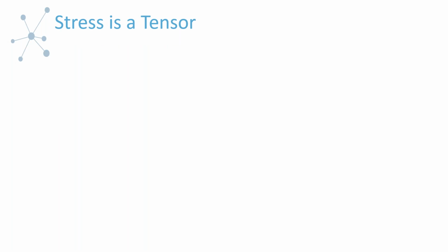So as we know, one of the components that we need to deal with is the dynamics, or the stress distribution that is generated under a particular deformation. And stress is a tensor. Before anyone gets concerned that this is a complicated topic, it's not, because everyone, I will argue, is already familiar with the concept of a tensor. Although we'll see in a moment that stress is a second order tensor, I'm sure that everyone is already comfortable with the idea of a first order tensor, which is more commonly referred to as a vector.